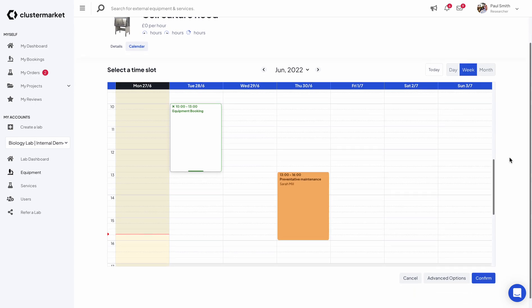What I have to do now after selecting the slot is clicking on advanced options at the bottom of the calendar.